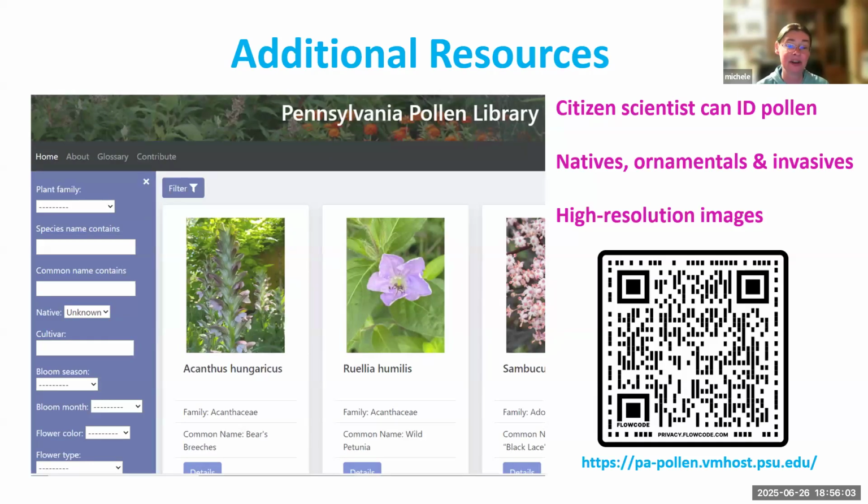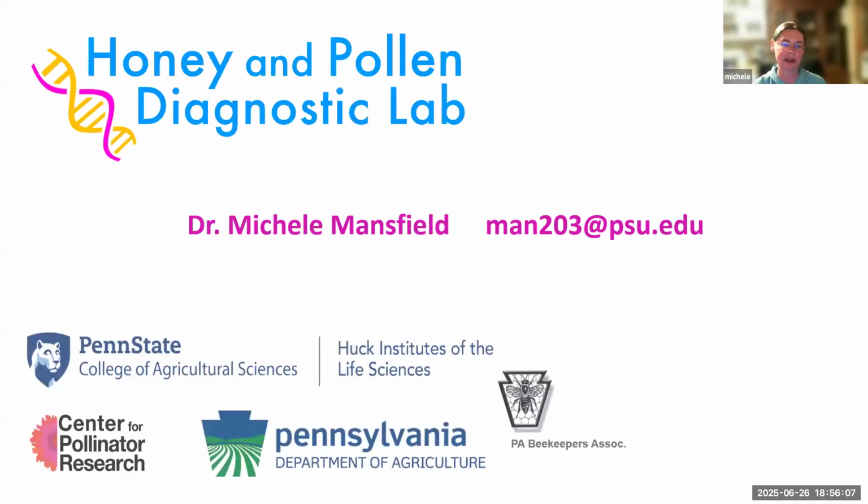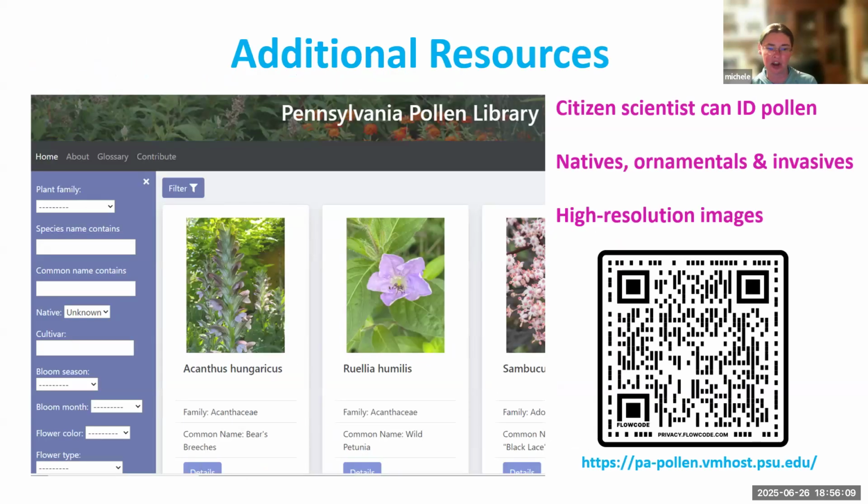Lots of plants. So anyway, what this website does is you can go in, and if you are identifying a plant in your yard, you could use it that way. If you did a photo identification, you could go on our site and this will show you high resolution microscopic images of your pollen.